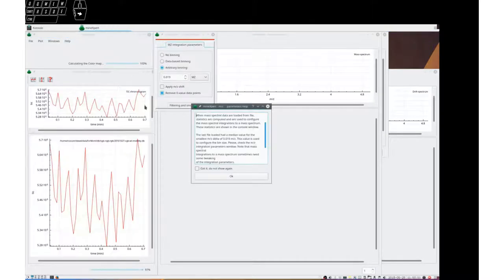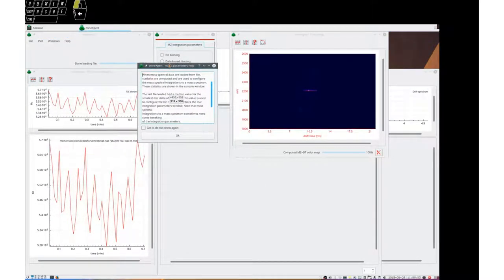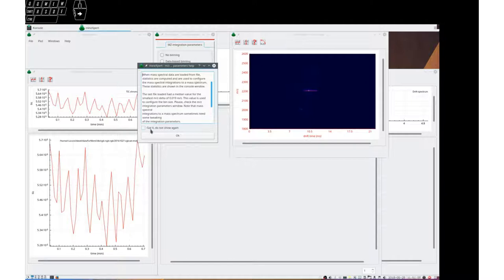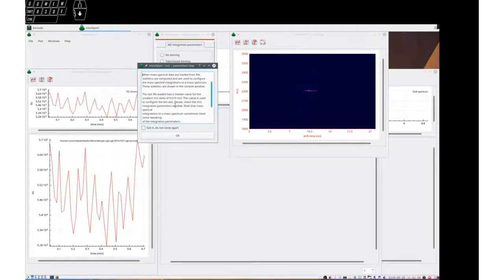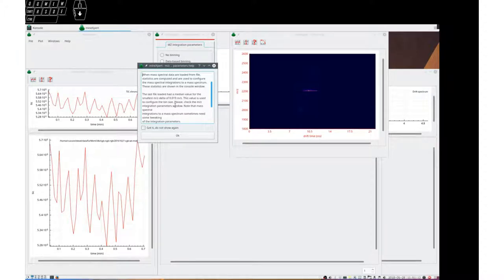This window that automatically displays until you check this checkbox that reads 'got it, do not show again' explains that when a file is loaded, the data inside the file are scrutinized and some statistical data are computed.